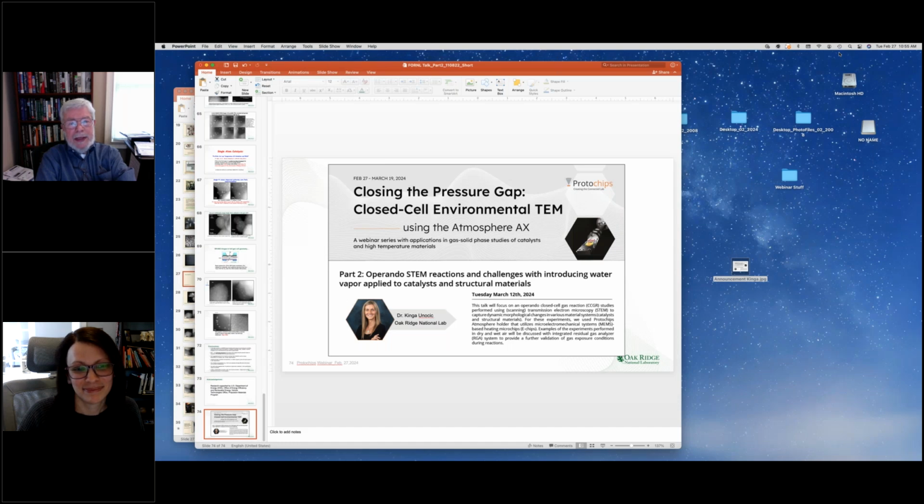what's keeping me working, and I just turned 80 last year, is the work that I've been doing in a major program at Oak Ridge on the studies of aluminum alloys. We've wanted to do in situ primarily heating experiments, because you don't need gas reactions for precipitation studies, but we do need a xenon plasma FIB.